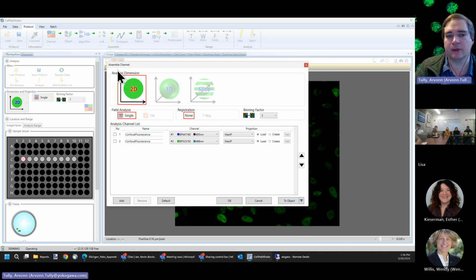So in the assemble channel object, this is where we're saying, what are the channels that we're going to include for this analysis? You may add more or fewer channels to your heart's content. This gives you an opportunity if you want to do some mixed projections.